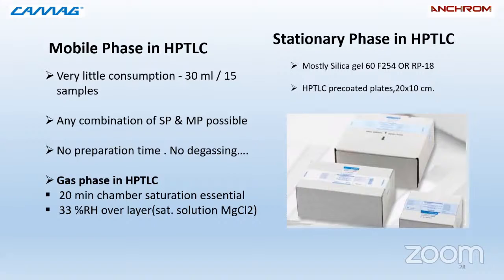If we talk about the gas phase, it comes into the picture in HPTLC if we are giving saturation to the chamber. 20-minute saturation time is essential, and we can control the humidity at 33% if we are using a saturated solution of magnesium chloride.